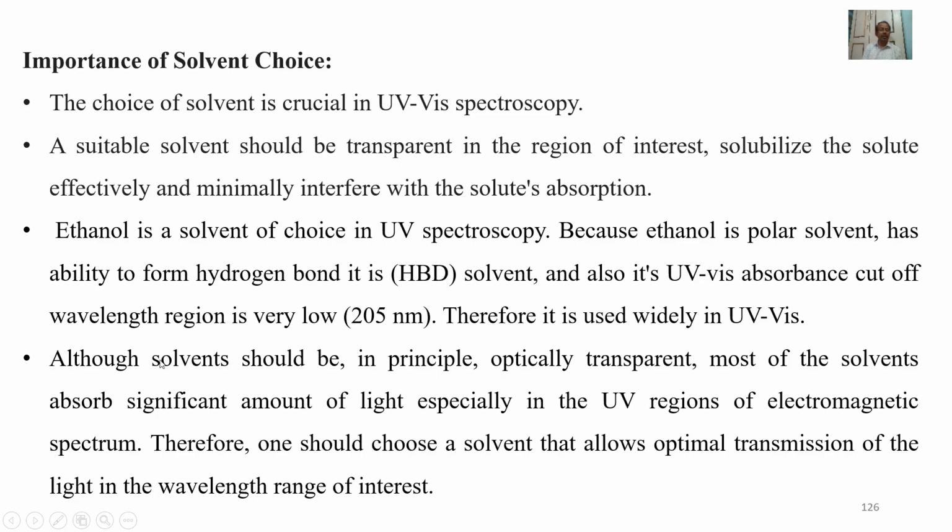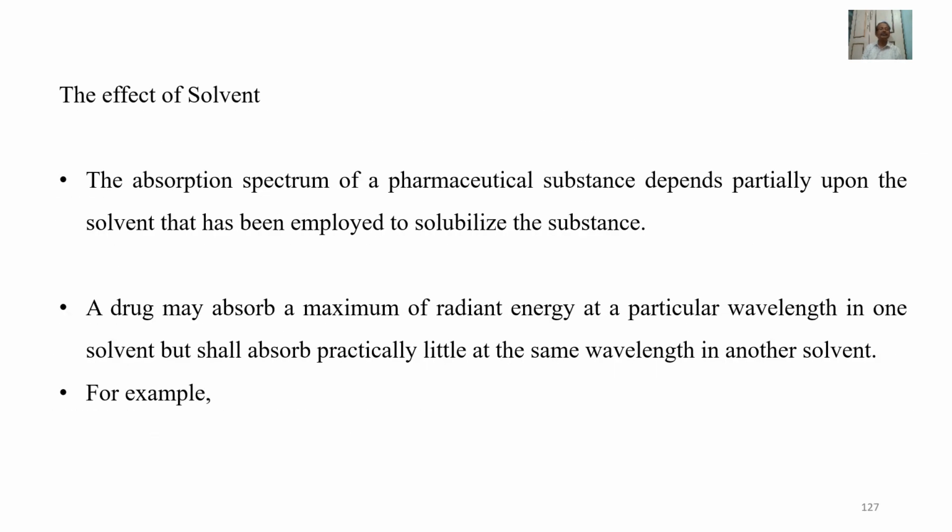Although solvents should in principle be optically transparent, most solvents absorb a significant amount of light, especially in the UV regions of the electromagnetic spectrum. Therefore, one should choose a solvent that allows optimal transmission of light in the wavelength range of interest. The effect of solvent.